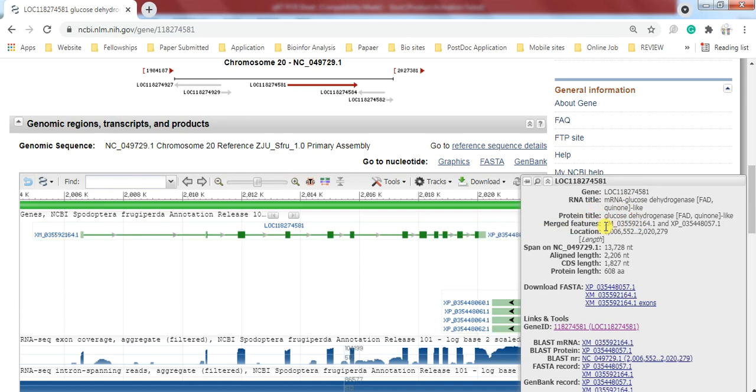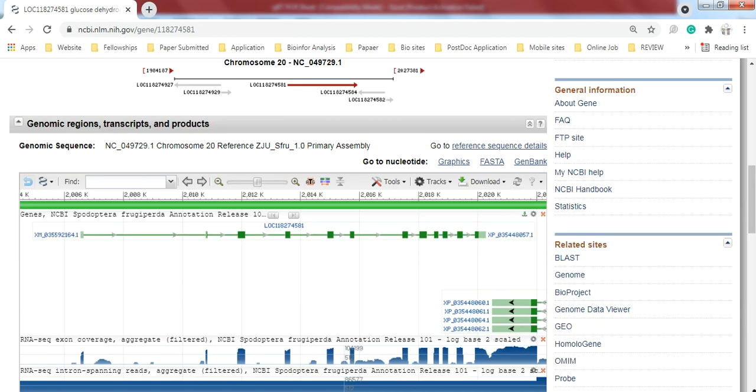This is the gene length: 13,728. It is the total gene length of this gene in terms of nucleotides or base pairs. That is 13,728.